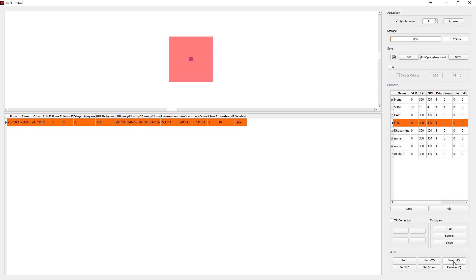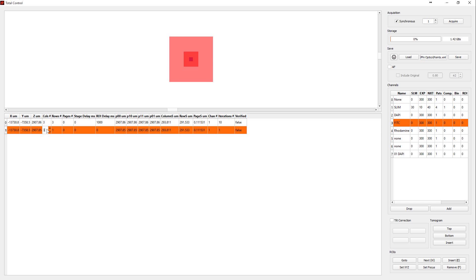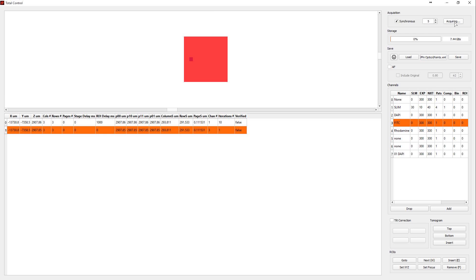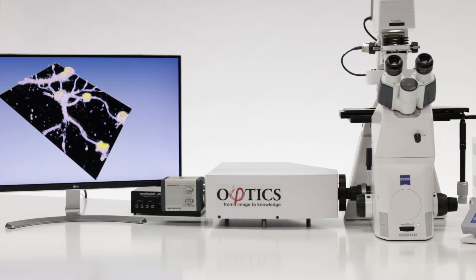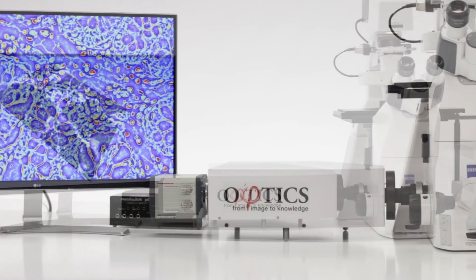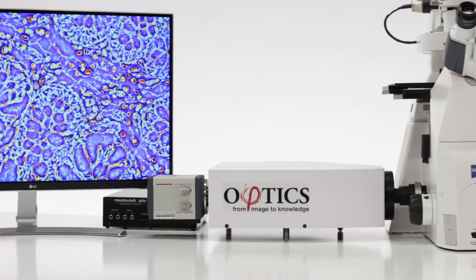Simply specify the region of interest, the time lapse between the various measurements, and how often these data have to be acquired. This type of long-term, large field-of-view, multiple-channel experiment will generate large amounts of amazing data. The SLIM Ultimate model comes equipped with a 100TB storage server to help you manage this data flux.